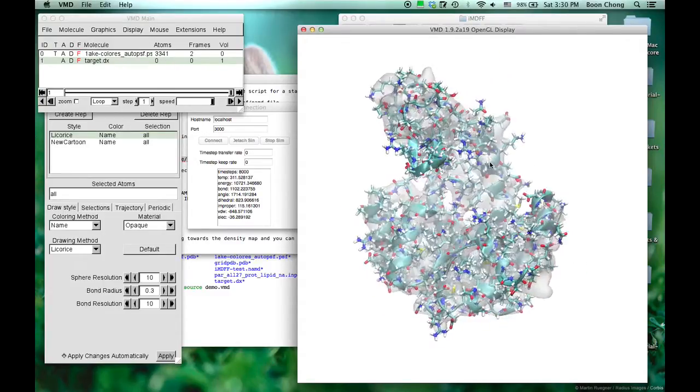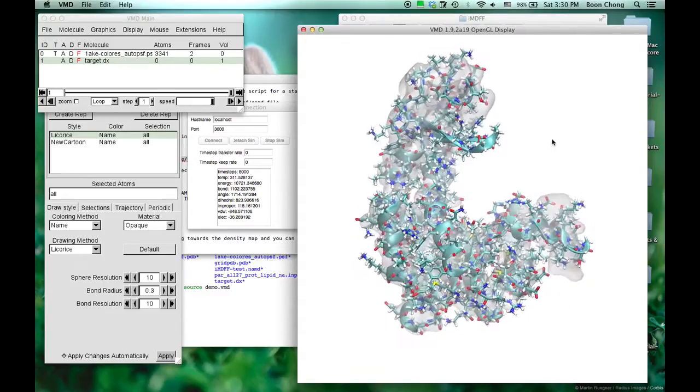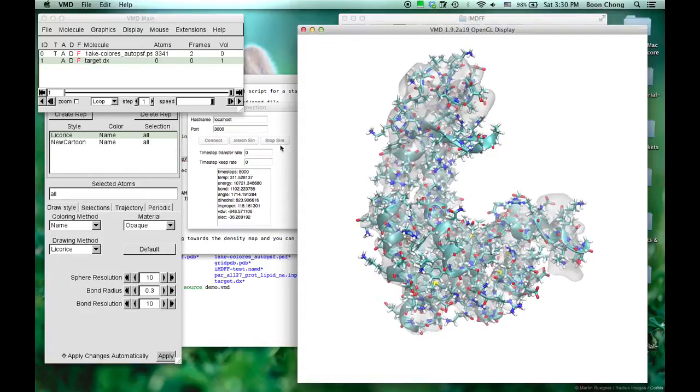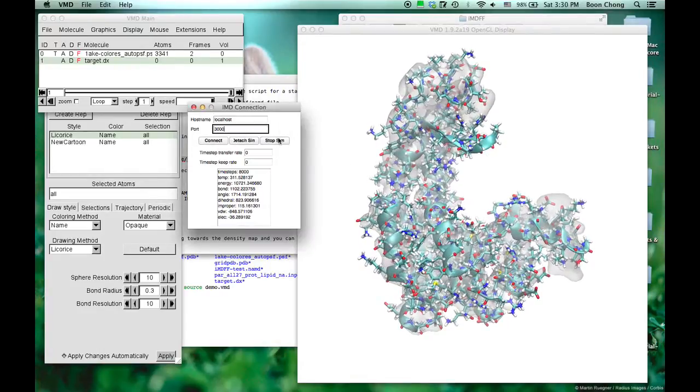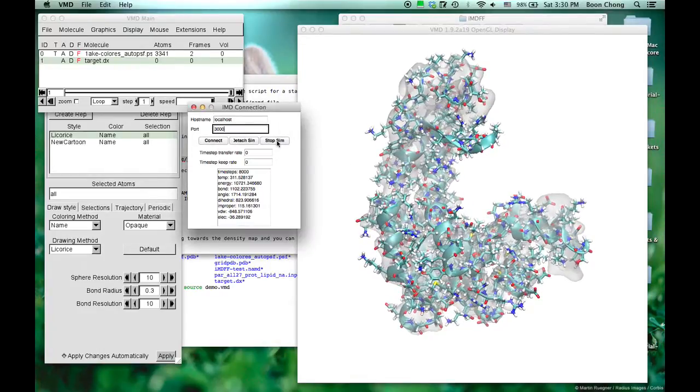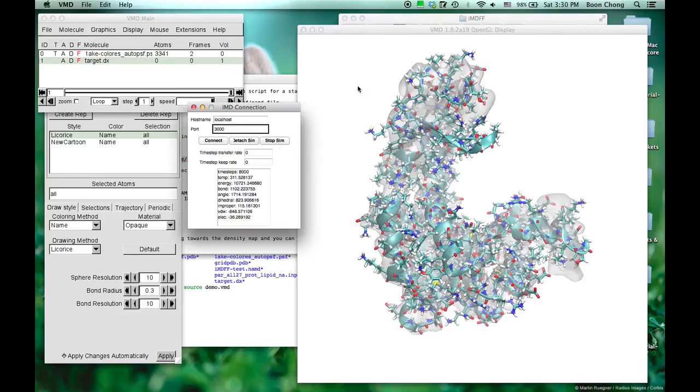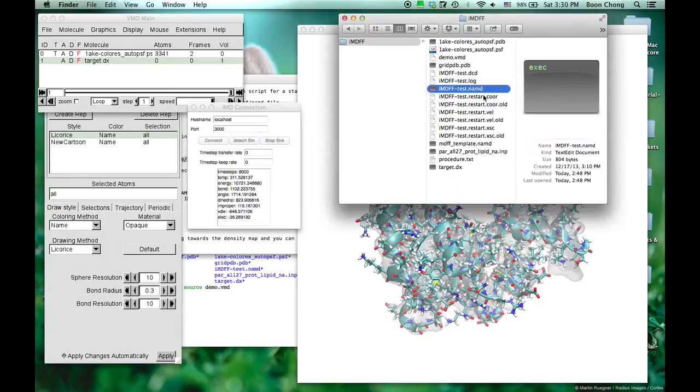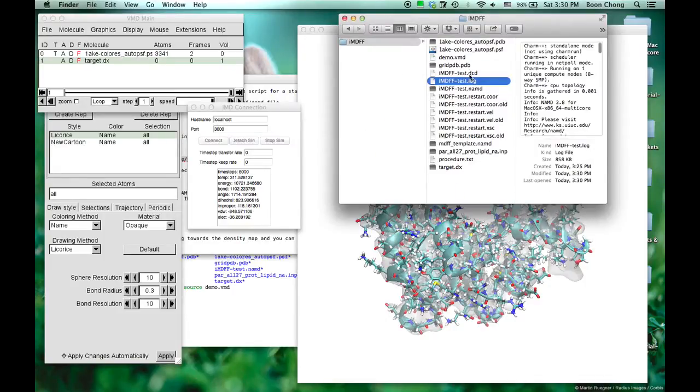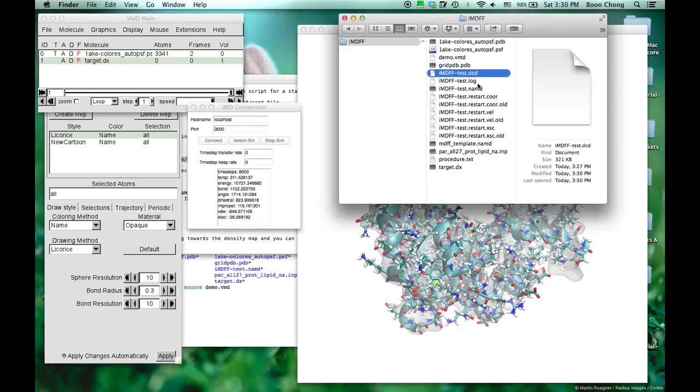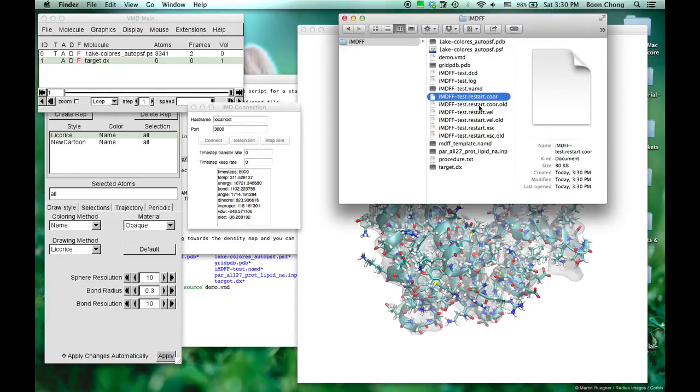It's done already. Let's stop the simulation. And it's already stopped. And you'll find all the files, the trajectory file, the log file, the restart files, just like any standard NAMD simulations.